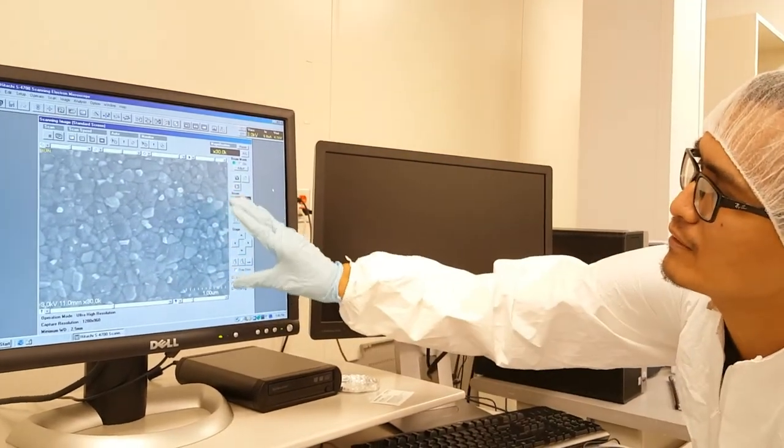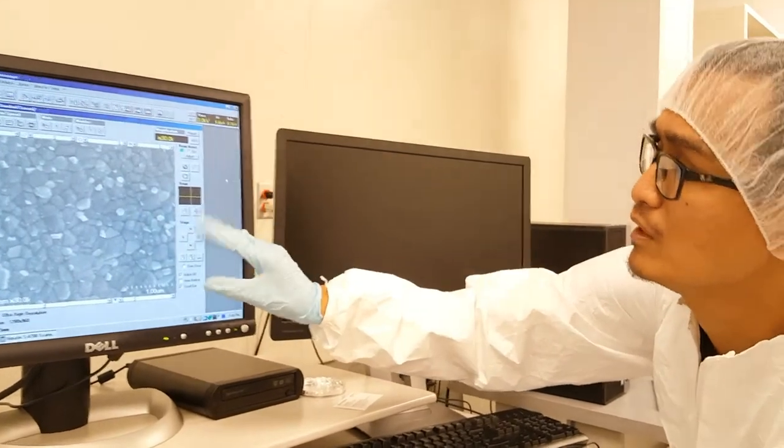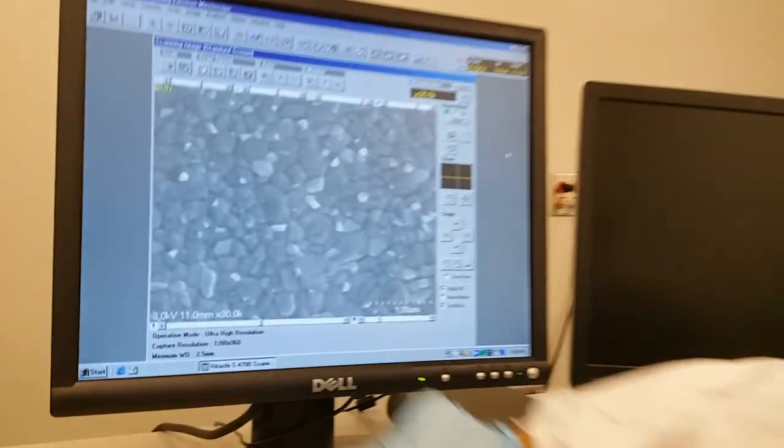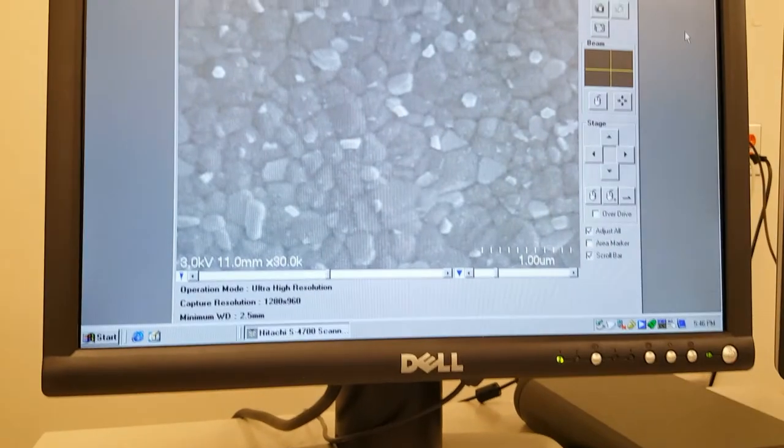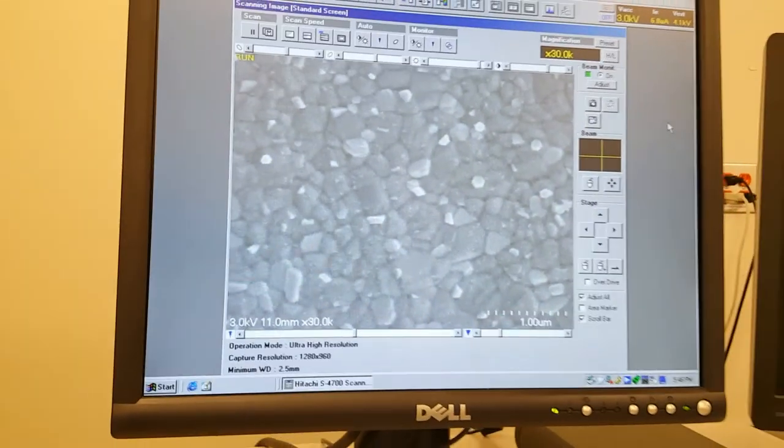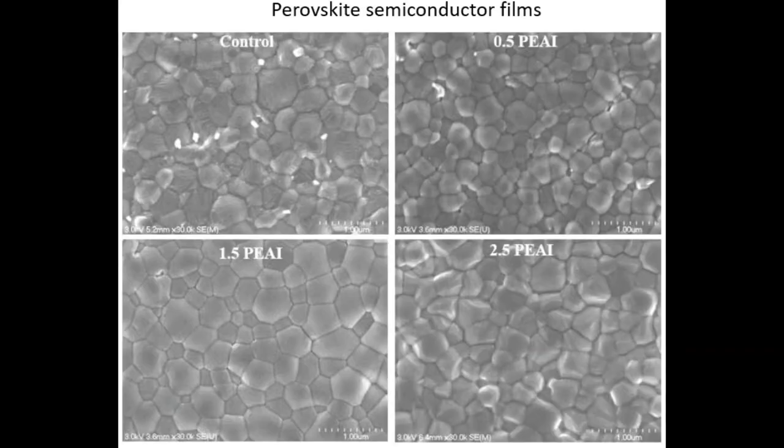This image right here is a magnified version of the sample which has a magnification of 30K. Here you can see much clearer images of perovskite semiconductor films prepared with various amounts of an additive called PAI, where you see variations in the grain size and smooth morphology of the films with various amounts of the additive.